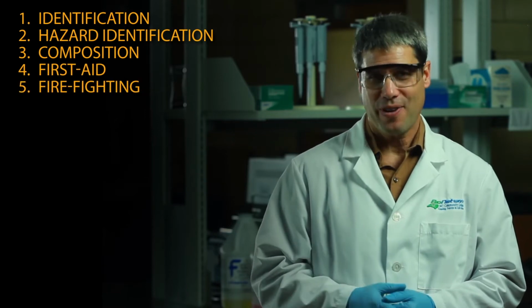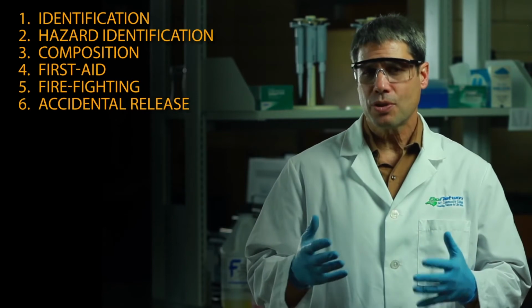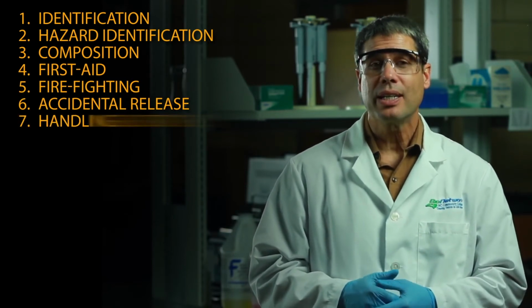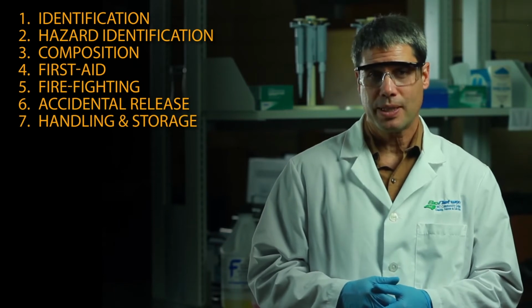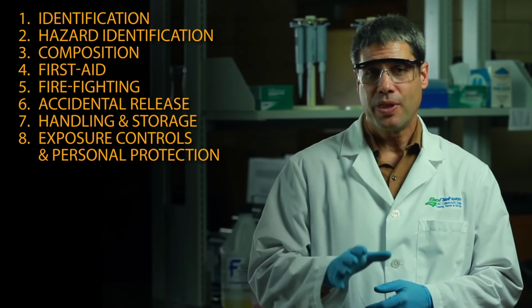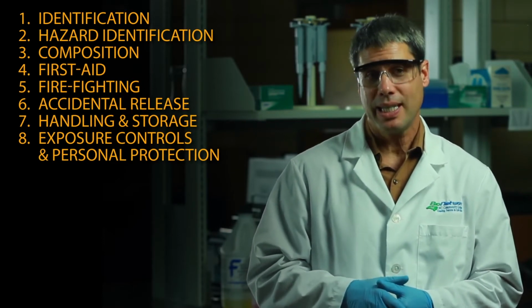Section 5, Firefighting measures. Section 6, Accidental release measures. These are instructions for containment and cleanup of spills or leaks. Section 7, Handling and storage requirements. Section 8, Exposure controls and personal protection. This describes OSHA's exposure limits and recommendations for PPE.